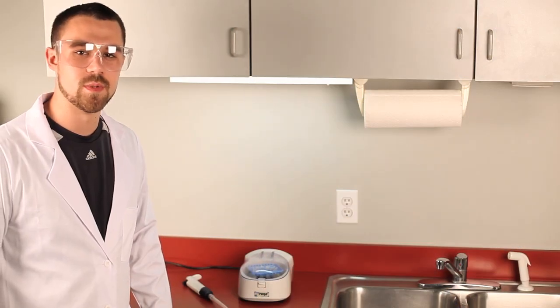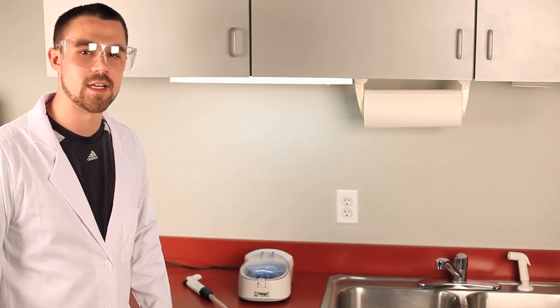If your centrifuge still spins or shakes in an uncontrolled manner, contact your manufacturer.